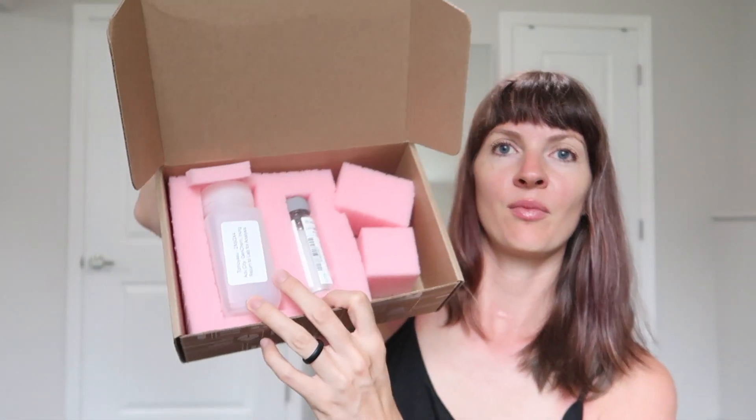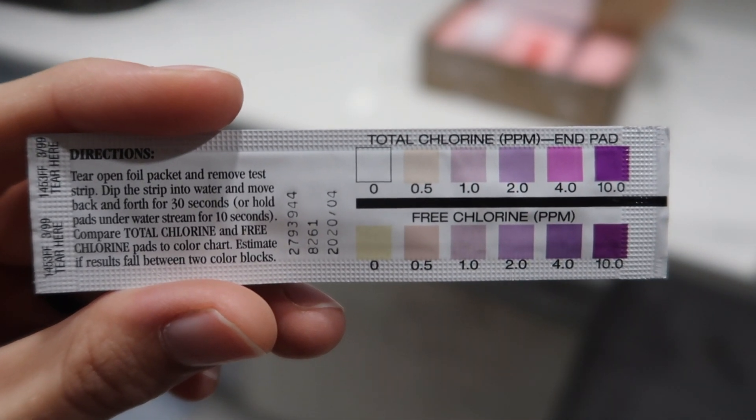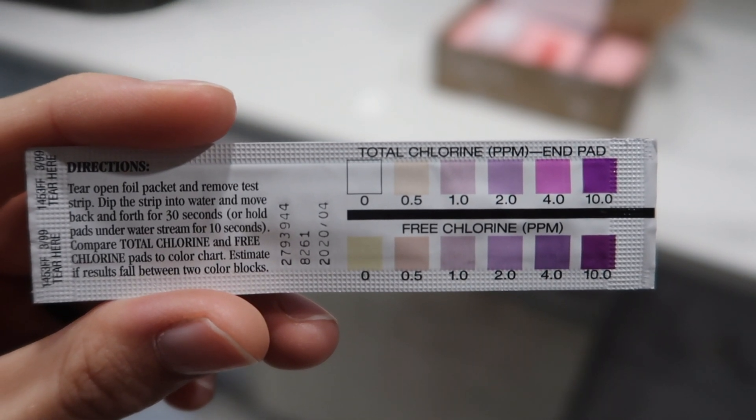I'm not gonna show you the return label because I don't want you to know where we live, but basically this is the kit. There's an Aqua Check water quality test strip for chlorine and free chlorine. So the chlorine strip we can do by ourselves now.